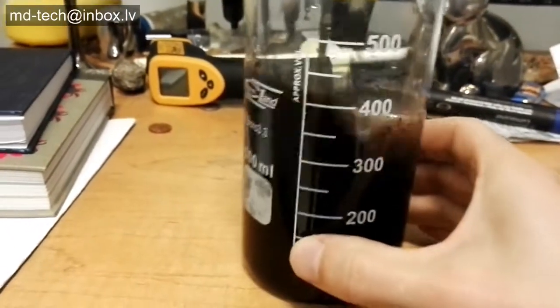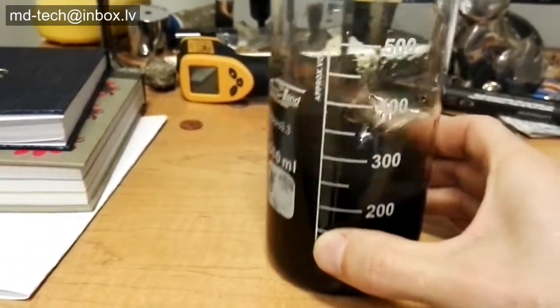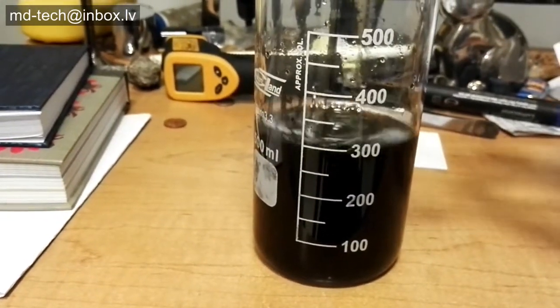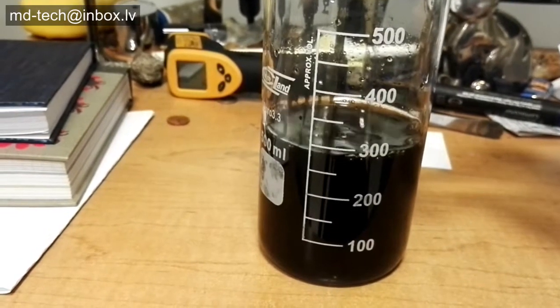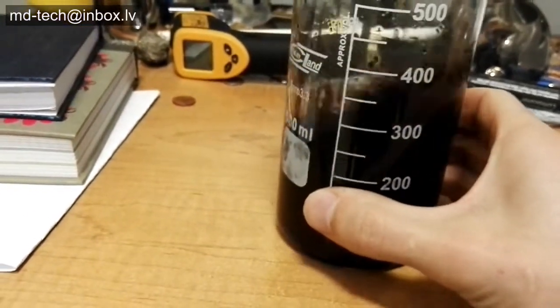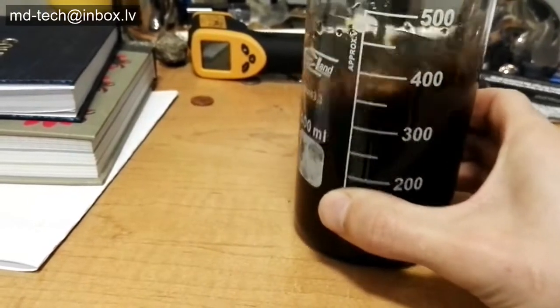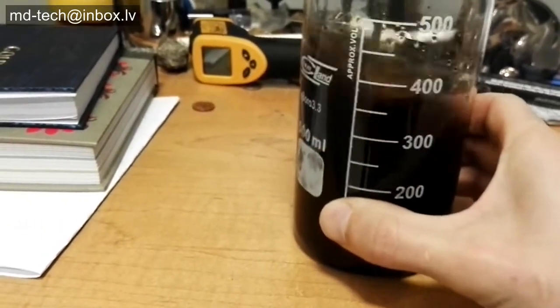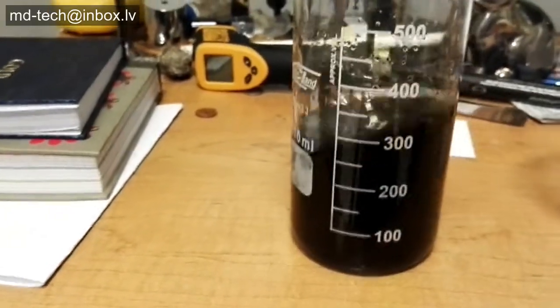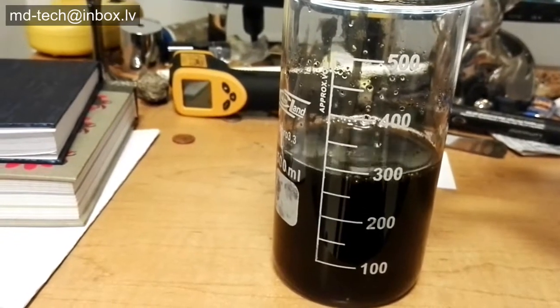Like you see, the reaction is very powerful. Add small amounts at a time. For this amount of liquid I use only 1 gram borohydride solution. Platinum group metal flakes are coming out.